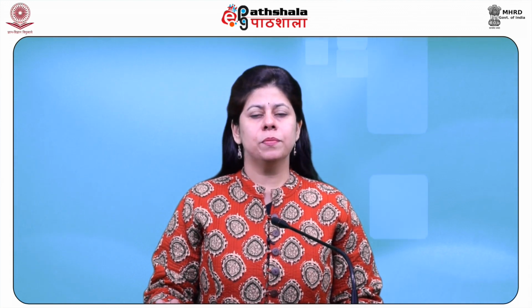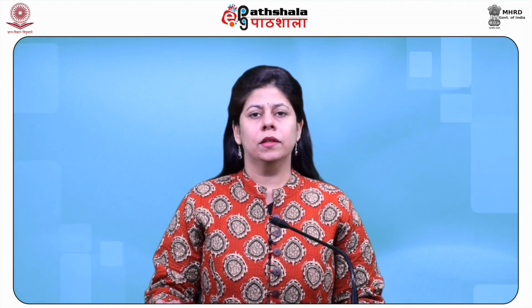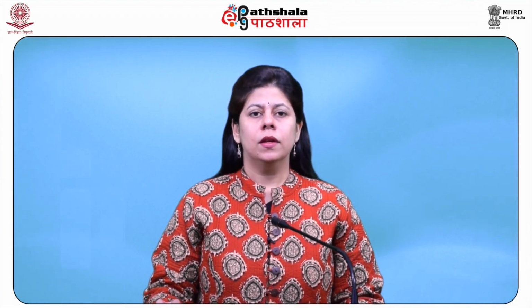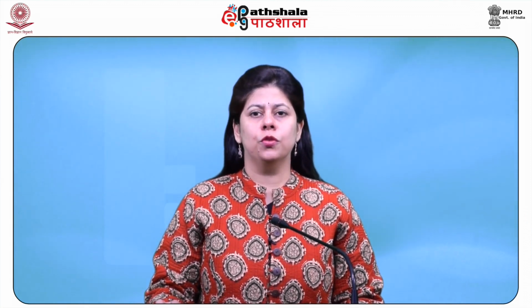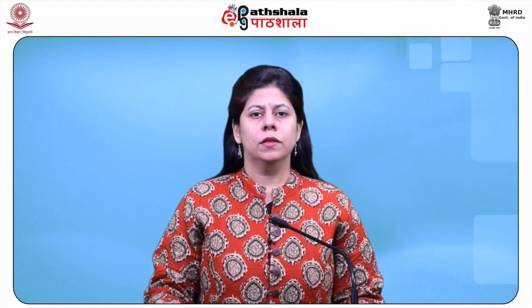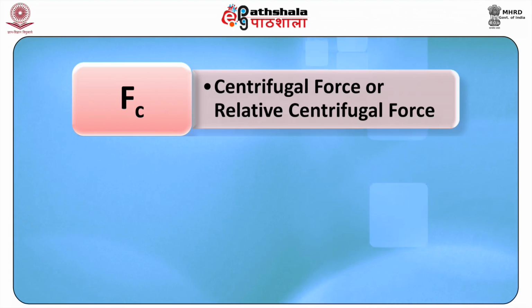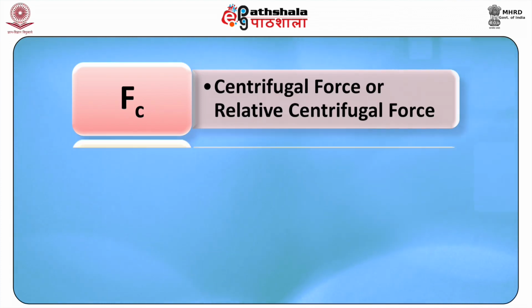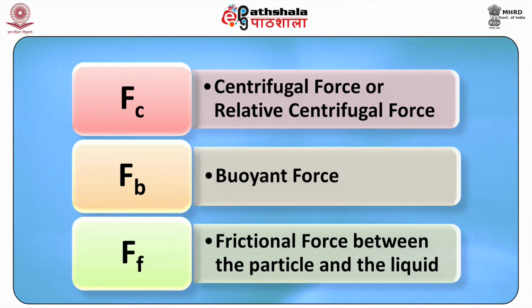The acceleration is measured in multiples of g, which is the standard acceleration due to gravity at the Earth's surface. Let us assume an element of mass m in a centrifuge tube filled with a liquid. The particle is acted on by three forces: Fc, centrifugal force or relative centrifugal force; Fb, buoyant force; and Ff, frictional force between the particle and the liquid.